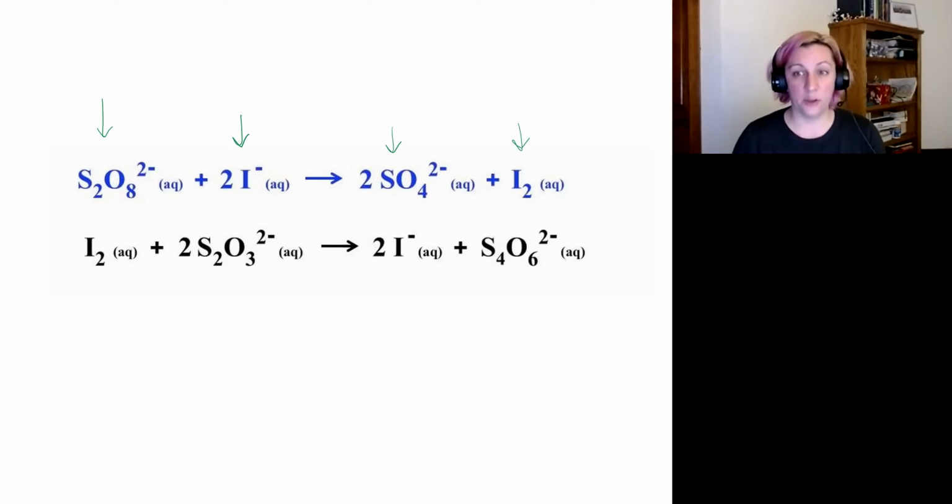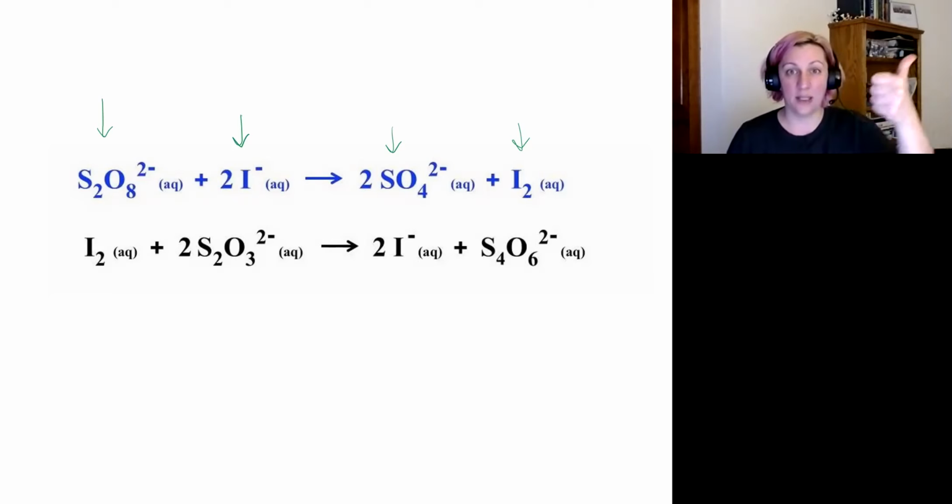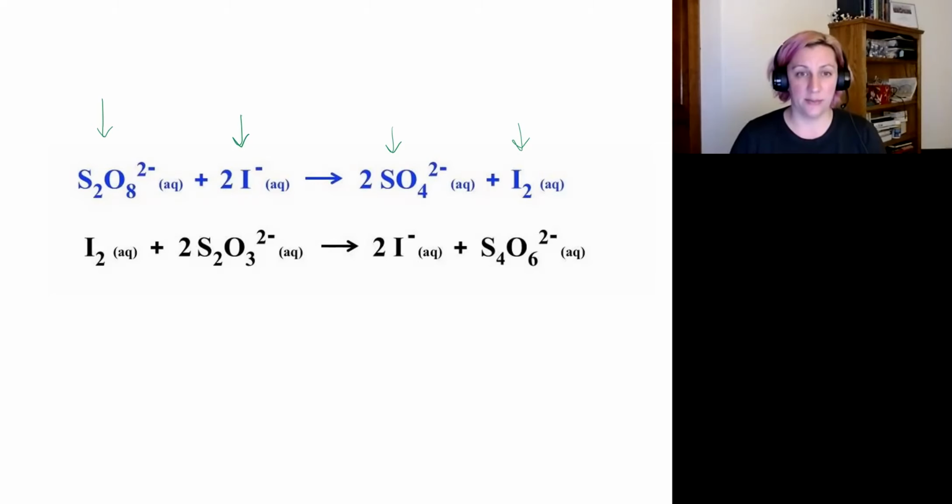This step in blue is the slow step, but it's still a fast reaction, to the point that if you were going to time it with a stopwatch, I wouldn't trust myself to do it perfectly, especially with the amount of human error between seeing something and hitting a button. But this reaction has a really clever trick that we can employ to calculate the initial rate of the reaction when it first starts taking place.